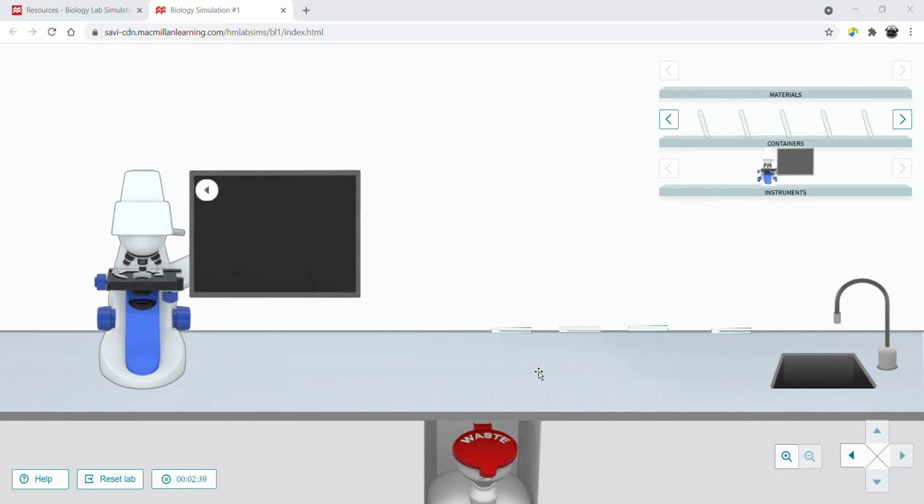And then to look at bacteria, generally there's a 100x, which gives you a total magnification of 1,000 times bigger than your unaided eye. So that's pretty cool.